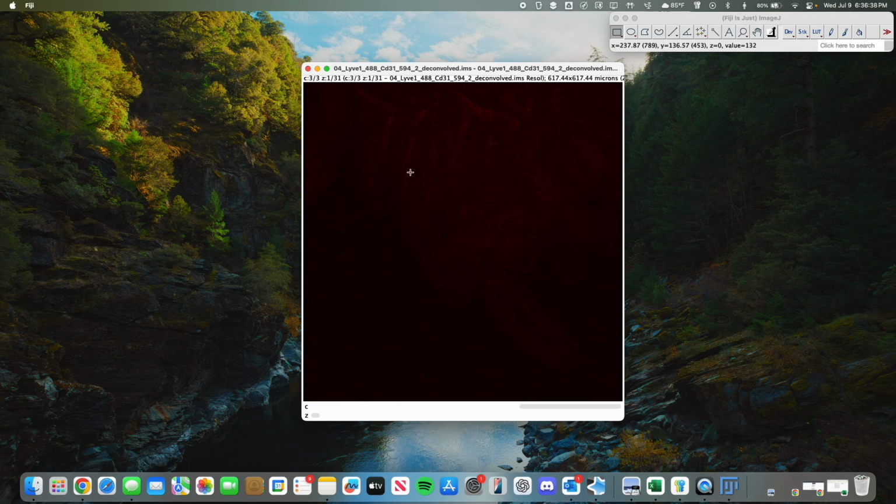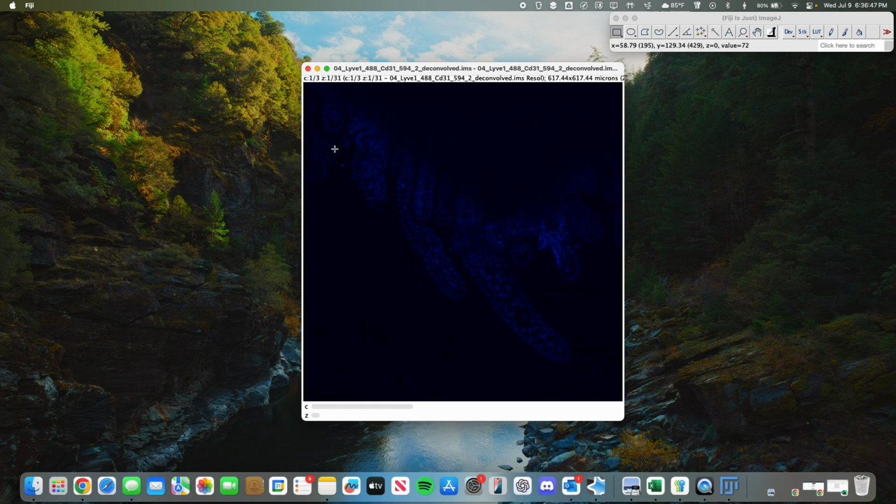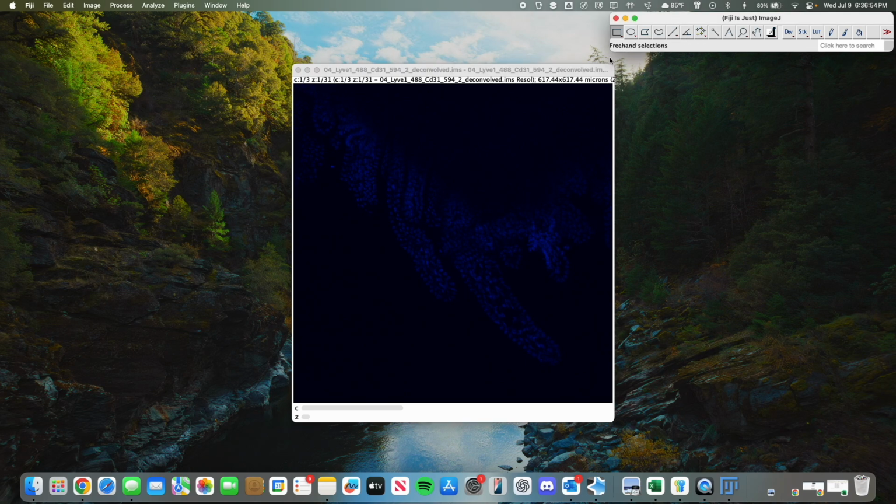And then the blood vessels are really irrelevant in this form as they're just scattered throughout, and you can see them here. So I choose not to bring them in just to reduce the amount of extra color that's in the image. All right, so first step is going to be the same.